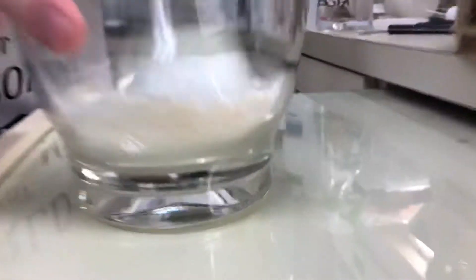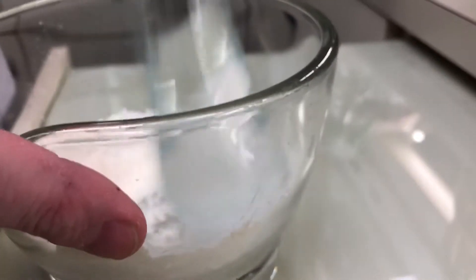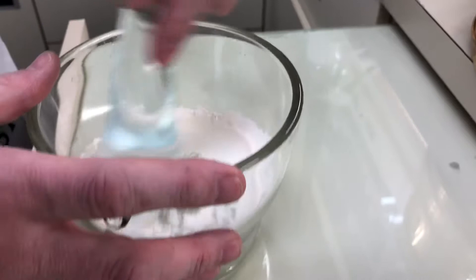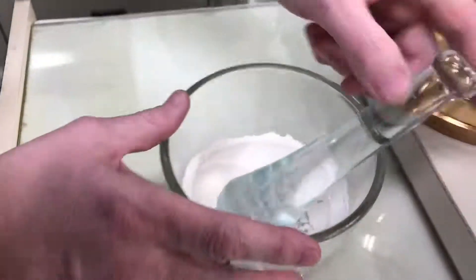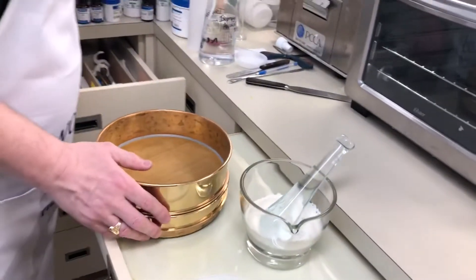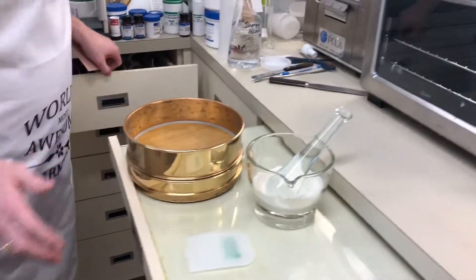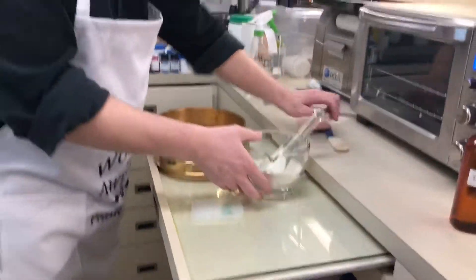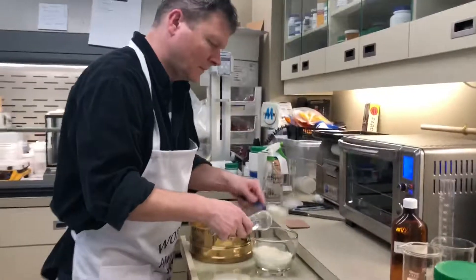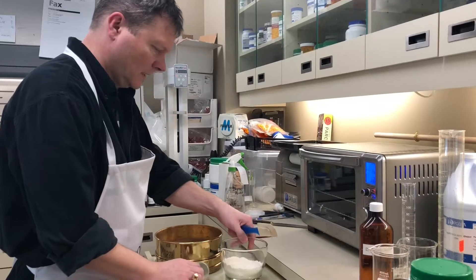Have a look in there — we're just going to blend them all up. We're going to put them through the sieve, and the sieve will ensure that they are all the exact same size, which is important for successful completion of these tablets.